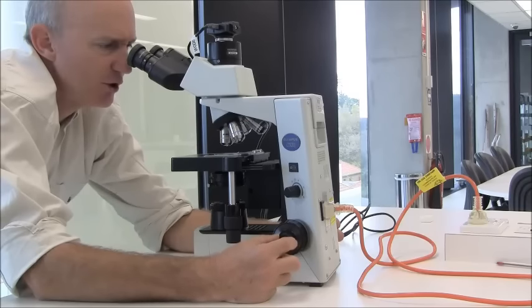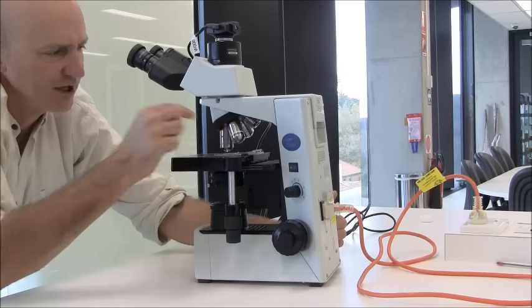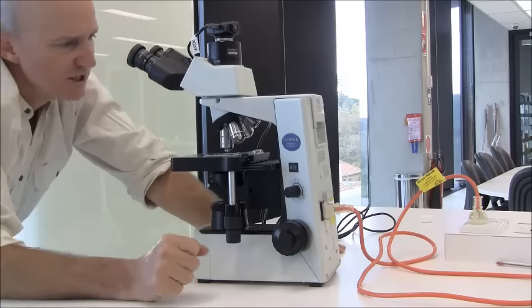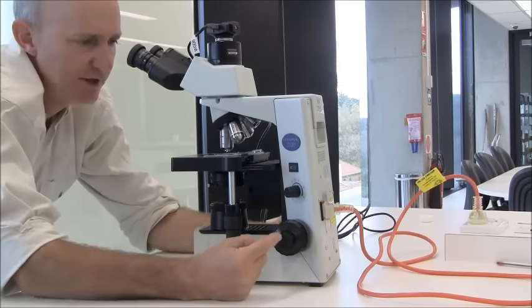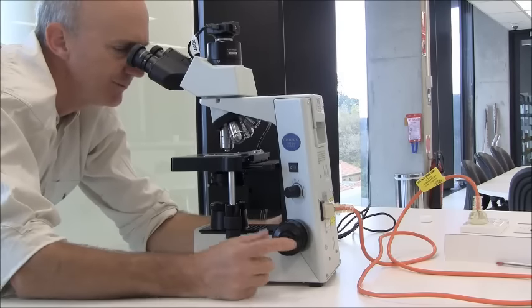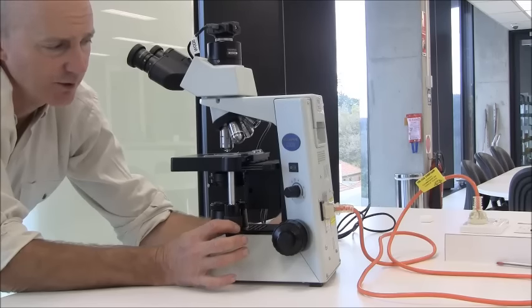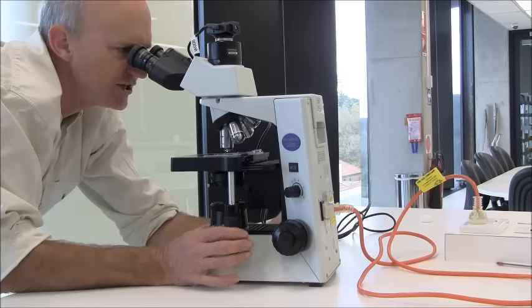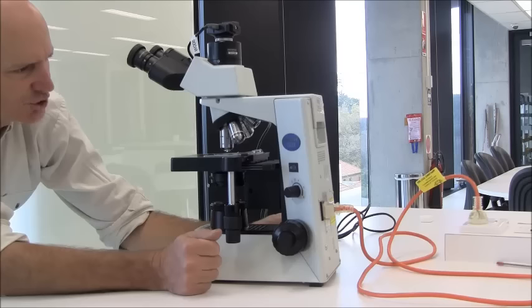Refocus using the fine focus, and if you want some more detail, go to the highest magnification. 10 times 40 is 400, 400 times its normal size. And then, of course, just sharpen the focus using the fine focus knob. And all the time, readjusting the particular structure you want to view, you get that into the center. And that should do it.